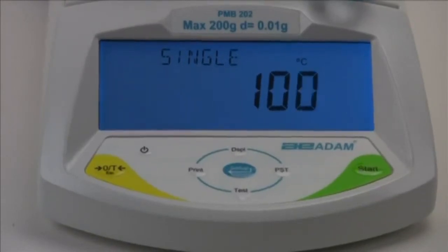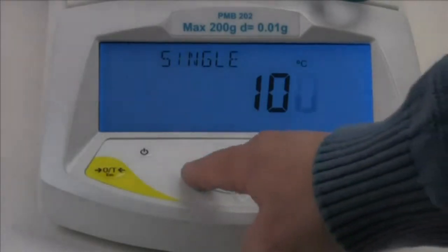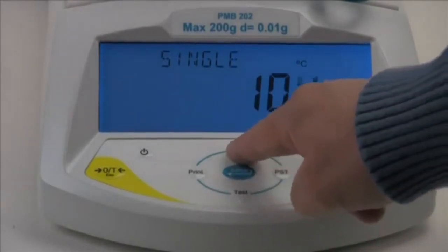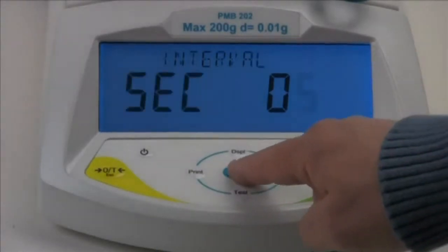You'll notice the display shows a temperature. To change the temperature, use the preset right arrow key to select the digit, and the display up arrow and test down arrow keys to increase and decrease the number. The temperature can be set from 50 to 160 degrees Celsius.